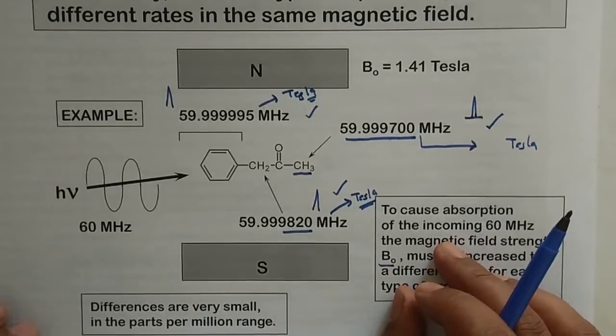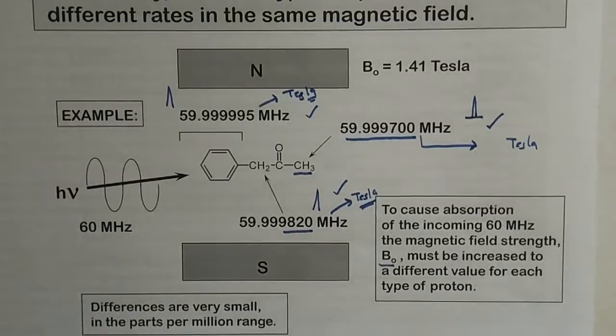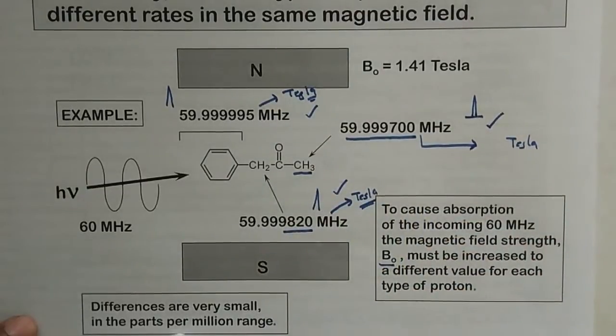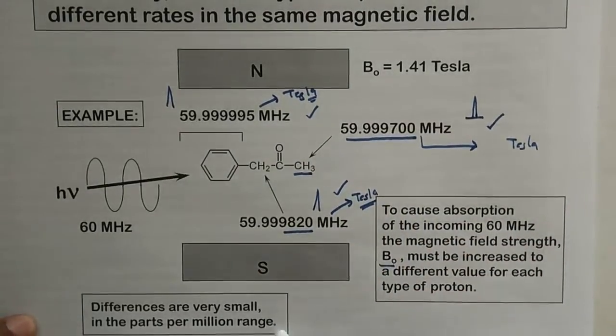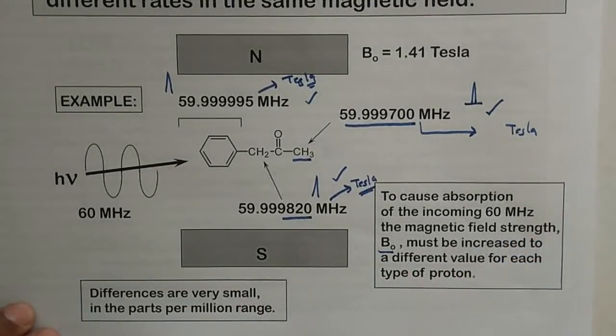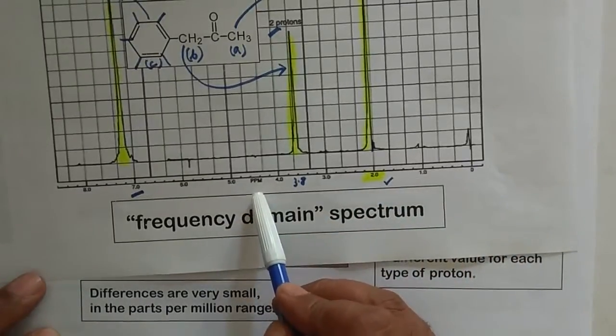These days the instrumentation is quite advanced, and you may have advanced NMR spectrometers, FT NMR instruments, which take only a few seconds to plot a spectrum. So this was the concept of your classical wave, right? And the differences are very, very small. You can see the differences are in the range of parts per million. So you can conclude from here also that the NMR scale is in parts per million, which I have shown you here also.